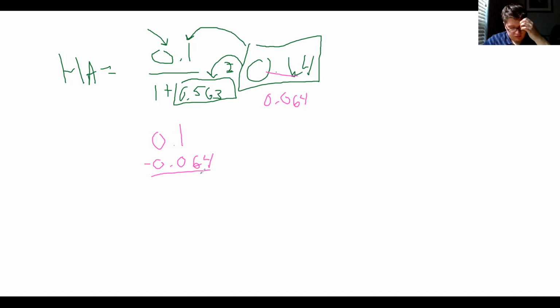And I got 0.036 for my A. But these are concentrations, which are moles per liter. So we're going to convert those.